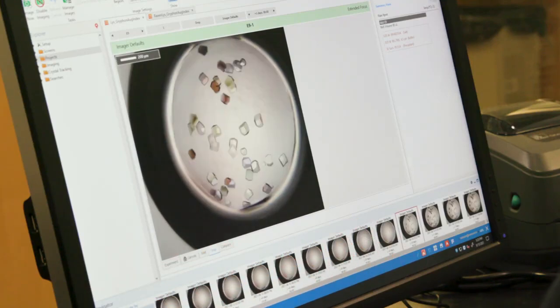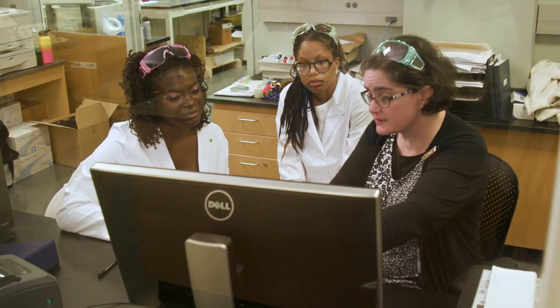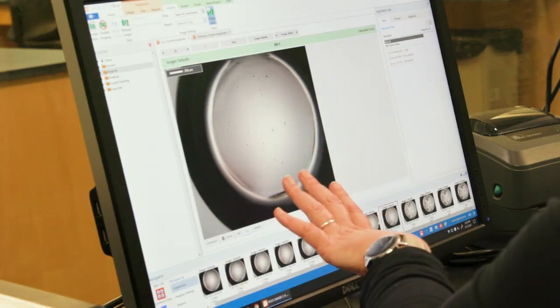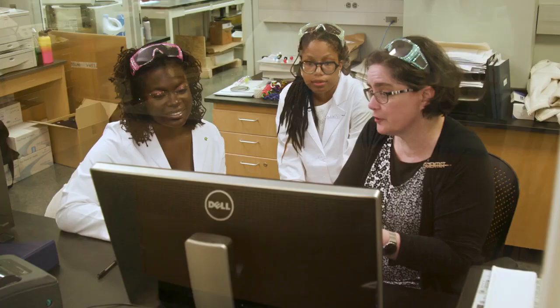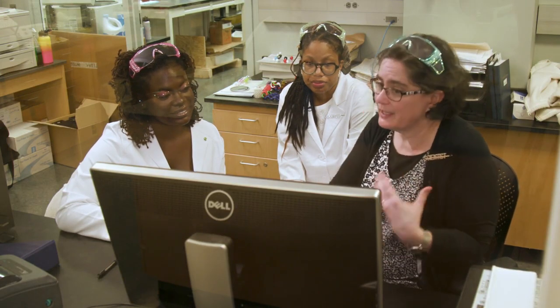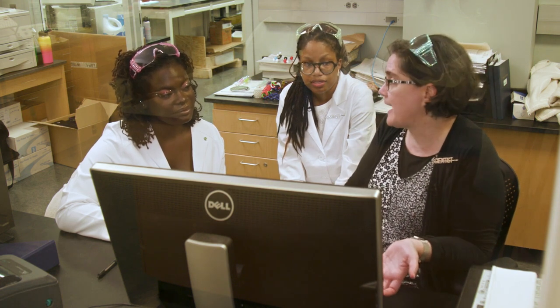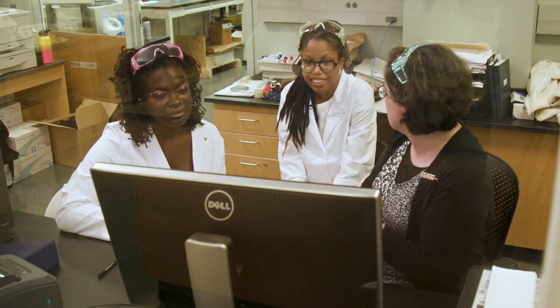Is there any information you can get from these time lapses? Actually, so some experiments you need super tiny crystals. And so for those, you could actually stop the crystallization process right here by adding some additional stuff. There's some that you need massive crystals for, and so for those, you want to just keep letting them grow. It depends on the experiment you're doing and what you need to do. And sometimes you form crystals and then you go back and you're like, okay, these are pretty good, but I'm going to optimize around them and stuff like that.